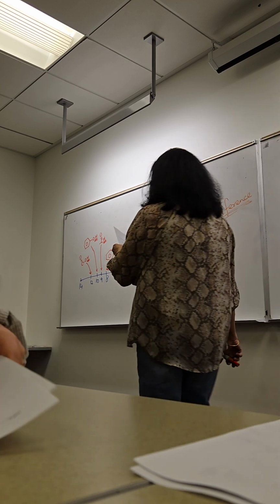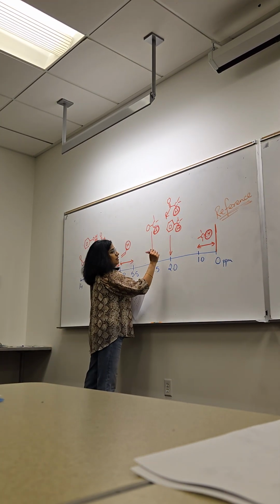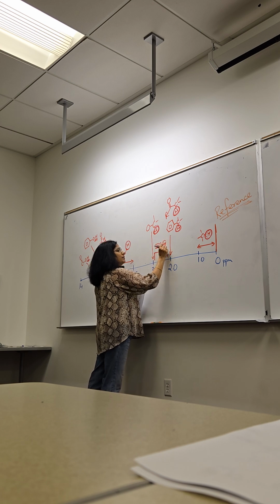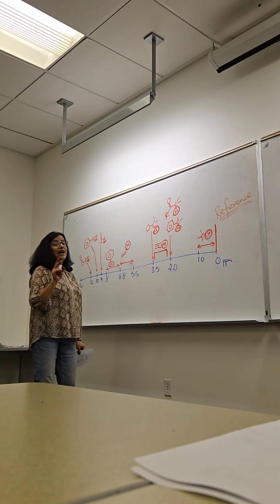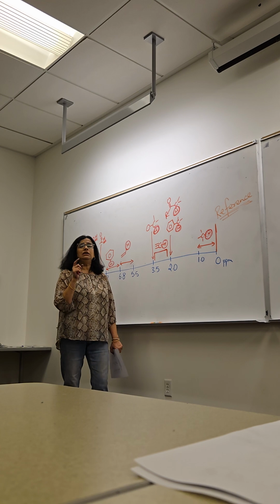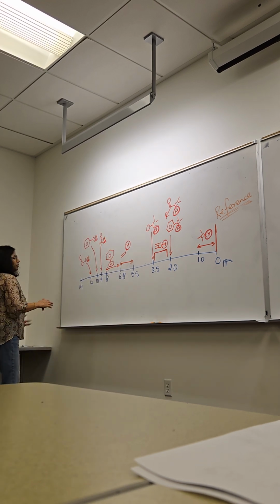Between 2.3 and 3.0, somewhere in this area, we can see an alkyne hydrogen. And last two, which are not here yet, alcohol OH and amine NH. They have a really big range.